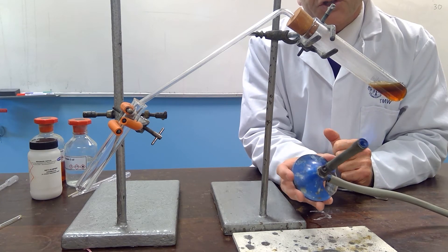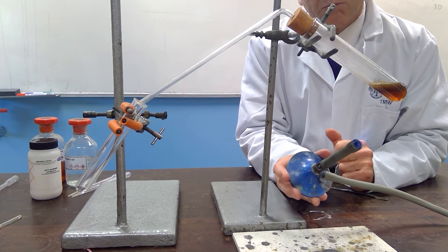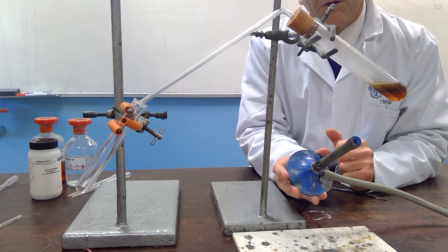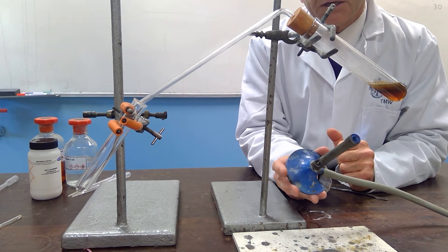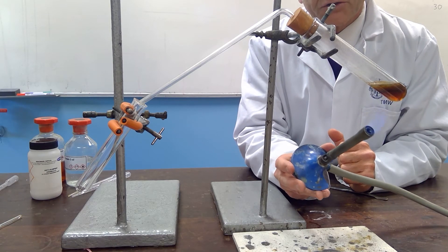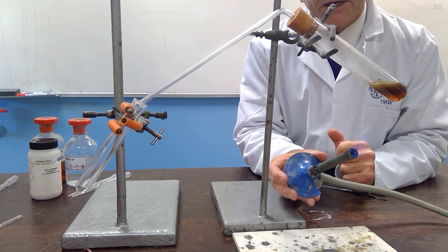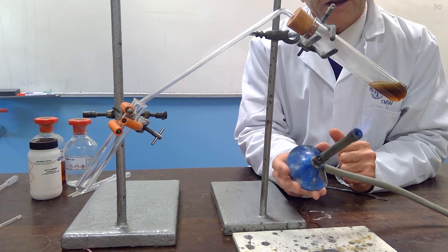So, this distillation is only done for the butan-1-ol and the butan-2-ol. The 2-methyl-propan-2-ol that we tested in the last video didn't give a reaction with acidified dichromate, and so there is no reason to bring across any product from that reaction, or that no reaction.